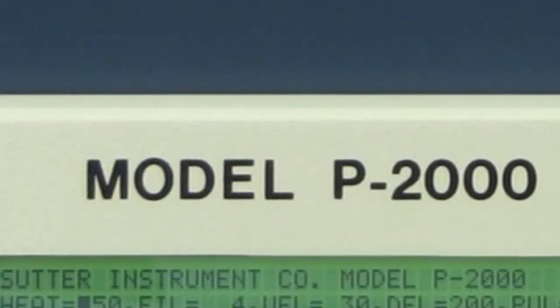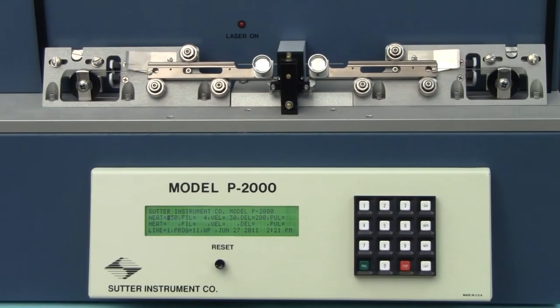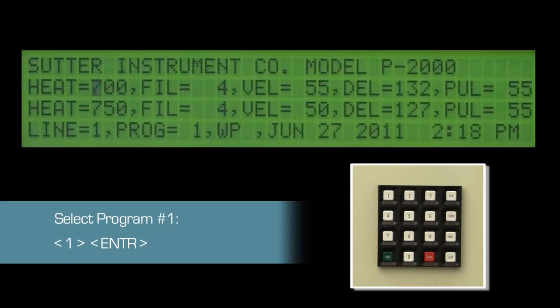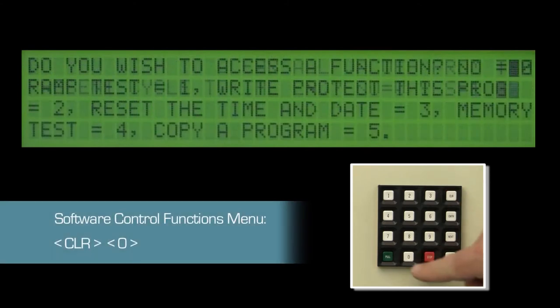On the P2000 puller we will copy program number 1, a sample program, to program 71. On this model you need to be within a program in order to access the copy function. So let's select program number 1. Hit the clear key followed by 0 to access the software control functions menu.